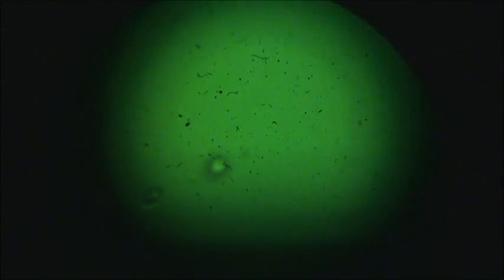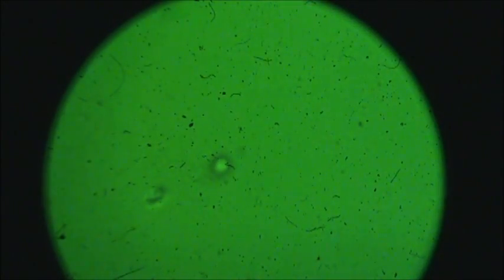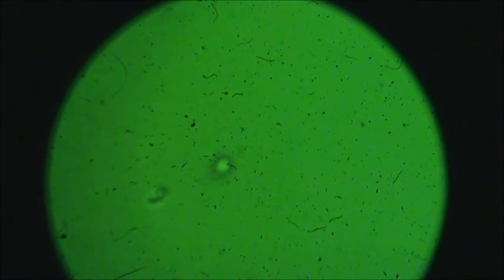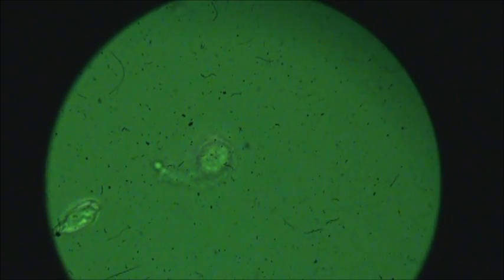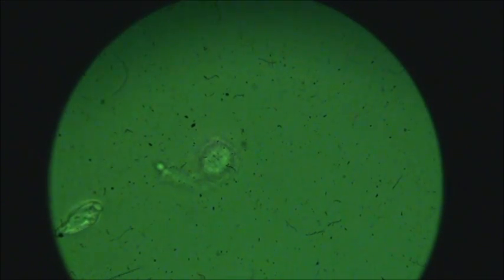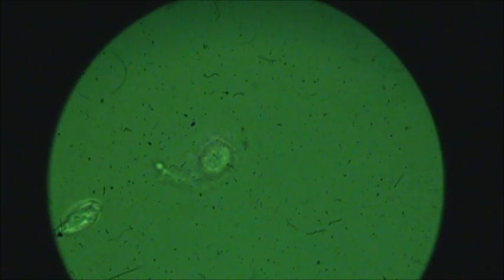This little dot in the middle is one of the cells that we pulled out of the ganglion, looking at it with the upright microscope with light coming from the bottom with a green filter. We can go to 40x and then we can clearly see that axon process coming out to the left and cell body to the right.